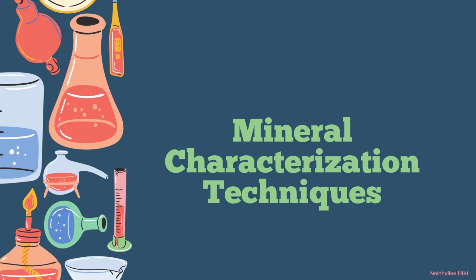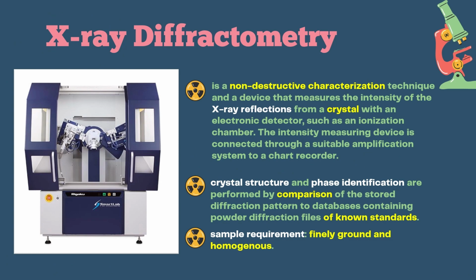Now we are going to briefly discuss 4 mineral characterization techniques, the XRD, TEM, SEM, and AES. The first one is the X-ray diffractometry.